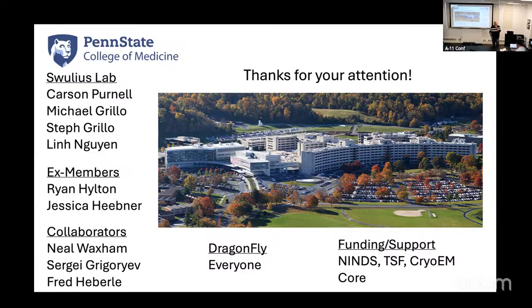All right, if other people want to jump in. It looked like at one point maybe you had patch-based training and at another point there were whole slices. So what do you usually have people use at this point? Everything is patch-based. Okay. In Dragonfly, we use these 2.5D patches. You pick the outer dimensions and then some number of slices. I always go 11 because that's the highest I can go. Okay.